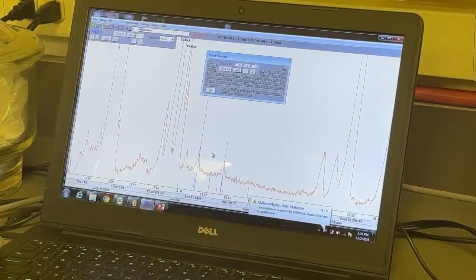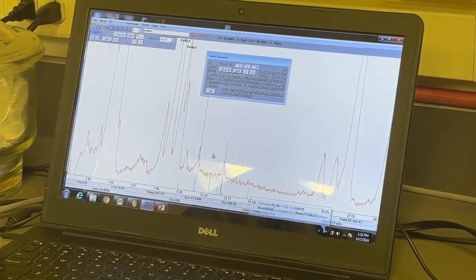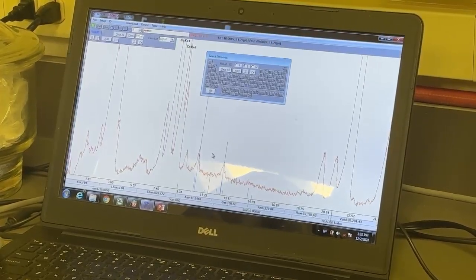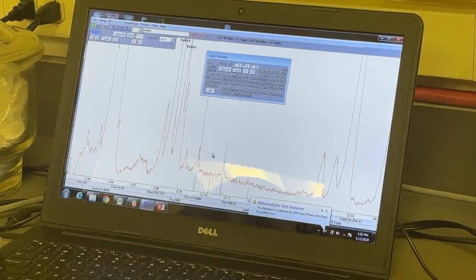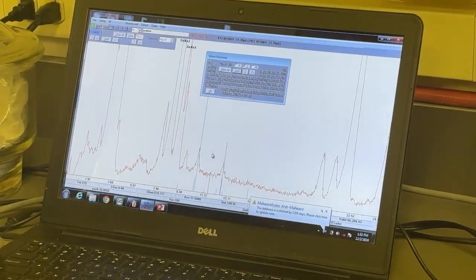Is that the lead? There is a very small amount. All right. Now we know. Well, I guess we're not going to be drinking tea out of this. It should be okay even, because that's really a small quantity. If we want to do another test, we can do it with another device and quantify it, but not this one.